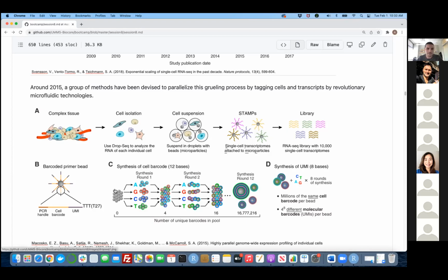Just a question before we go forward. Do you also have the hashtagging in DolphinNext for analysis later, or no? Is that something that will be added? I can talk about that later, but yes, we have a potential pipeline, but it's still in development. We're going to make it public really soon. Oh, that's great, because a lot of people are actually asking that.